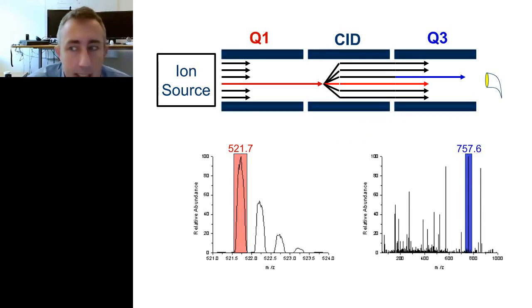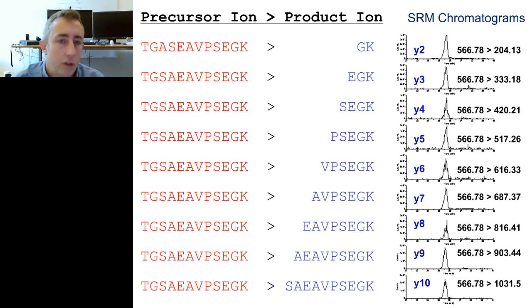So we use a different type of mass spectrometer called a triple quadrupole, where we basically start with peptide sequences. We tell the quad to measure individual peptides. We subject them to collisions, and then we measure fragments in a second filter called Q3. And this becomes a very selective filter. So if you wanted to measure this peptide, we would measure it in this series of fragments, and then you'd have this chromatogram versus time, which is only reflective of signals from that precursor mass and those fragment ion masses. So this becomes a fairly unique signature.